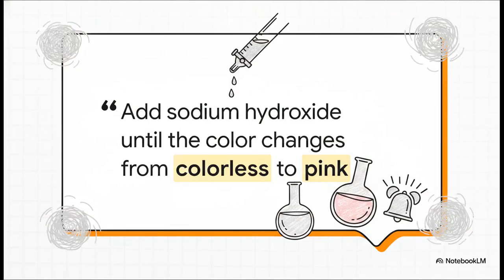This right here brilliantly illustrates the climax of our lab work. Imagine you're swirling this clear liquid, adding base drop by drop, and then suddenly, boom! The instant that solution shifts from colorless to a faint, persistent pink, the phenolphthalein alarm bell rings. That color change is basically the molecules yelling, "Stop! You've hit the equivalence point. The neutralization is totally done." We stop the burette immediately and record exactly how much liquid we used.